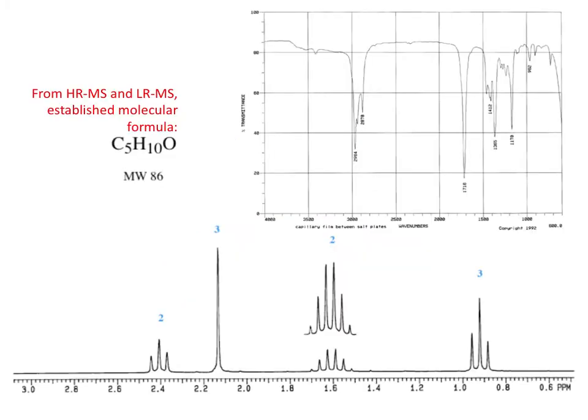So we're provided three main pieces of information. We are provided with the proton NMR spectrum, which you can recognize down here at the bottom of the screen because the units here are ppm and the axis range is reasonable for that of NMR, which generally starts at 0 ppm and goes up to a max of 14 ppm. Since we've cut off the spectrum here at 3 ppm, you can assume there's nothing further downfield in this spectrum.